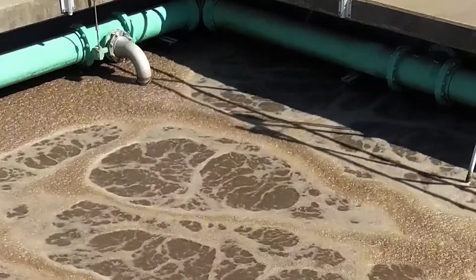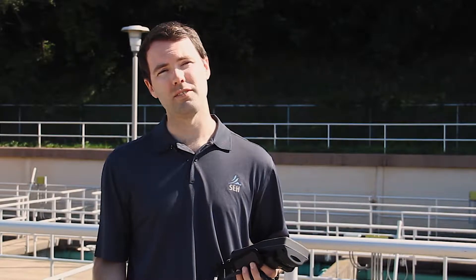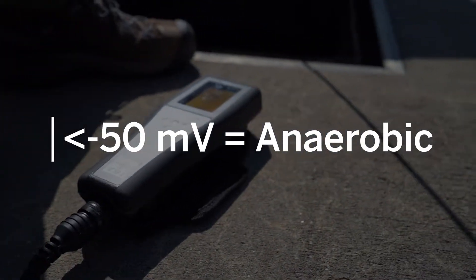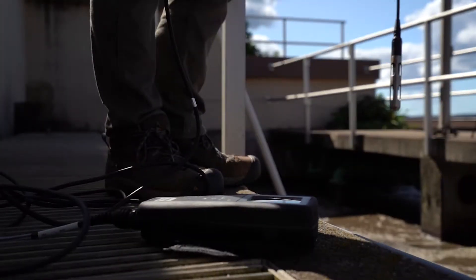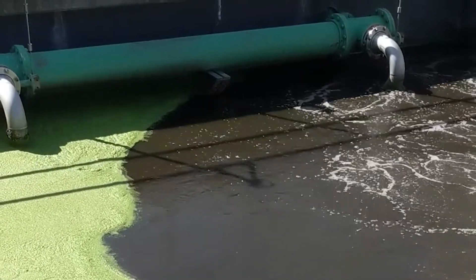With this ORP probe we can measure the millivolts or electric potential in the basin. We're standing on top of the anoxic basins here where they do bio phosphorus removal, so we can lower this probe down and check the values. If it's a very negative value — less than negative 50 — those are anaerobic conditions, and that's what we want to harvest the bugs for biological phosphorus removal. We'll also check in the aeration basins to make sure there's good oxygen dispersion within the plant and make sure there are no dead zones.